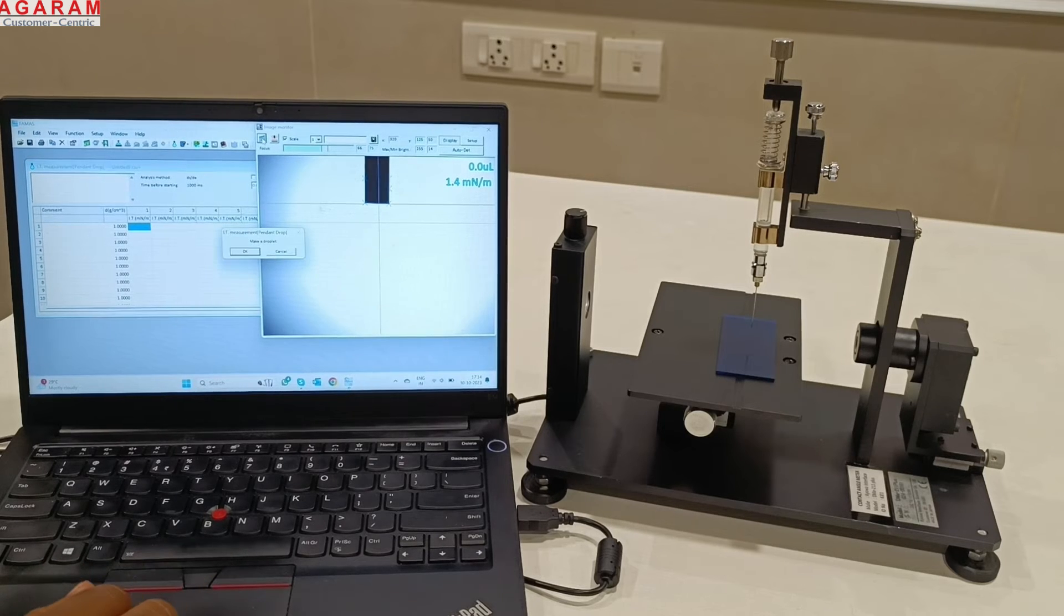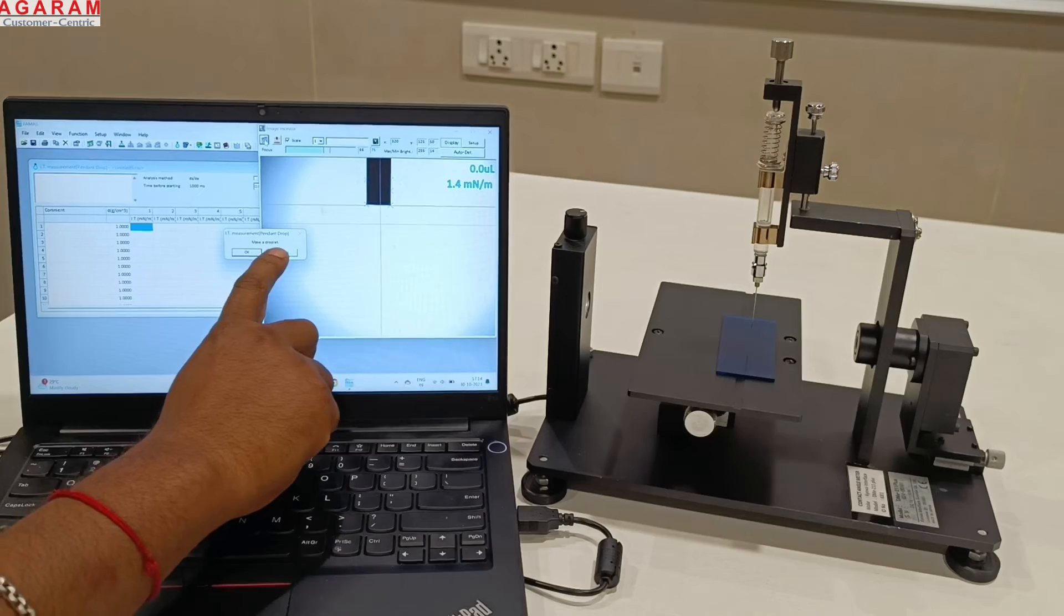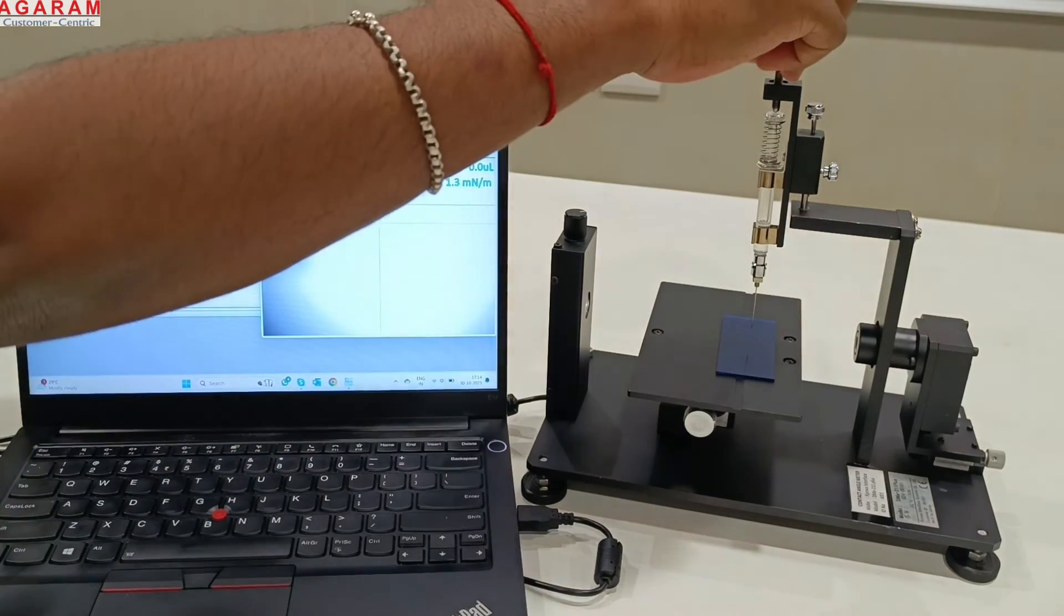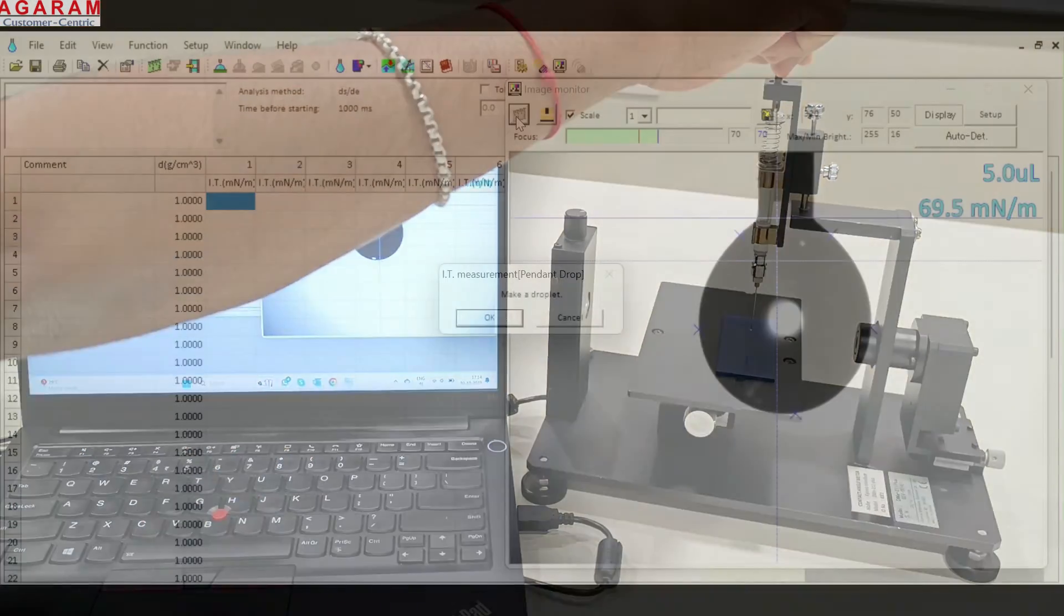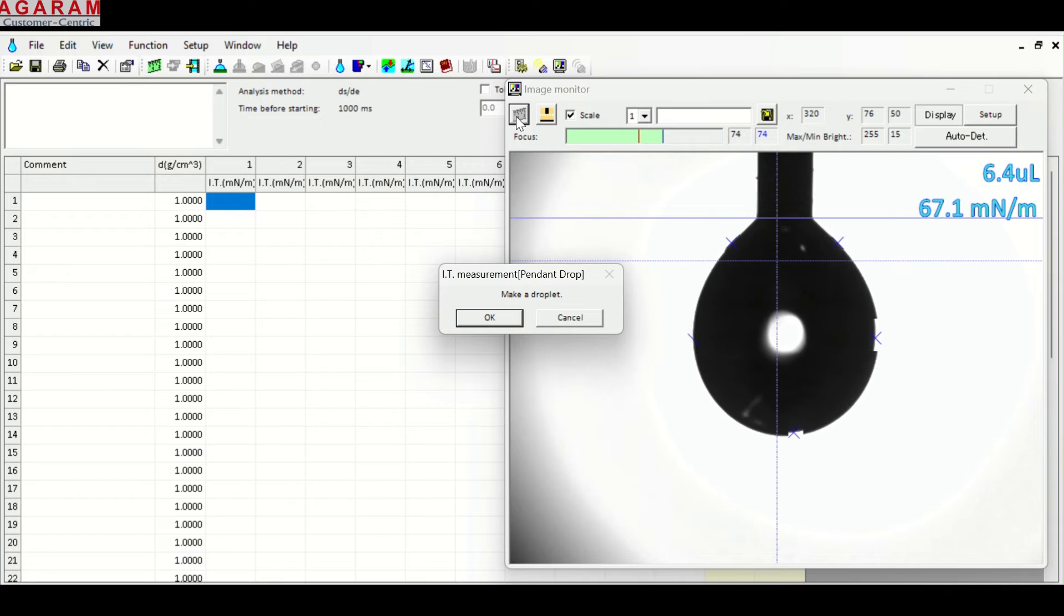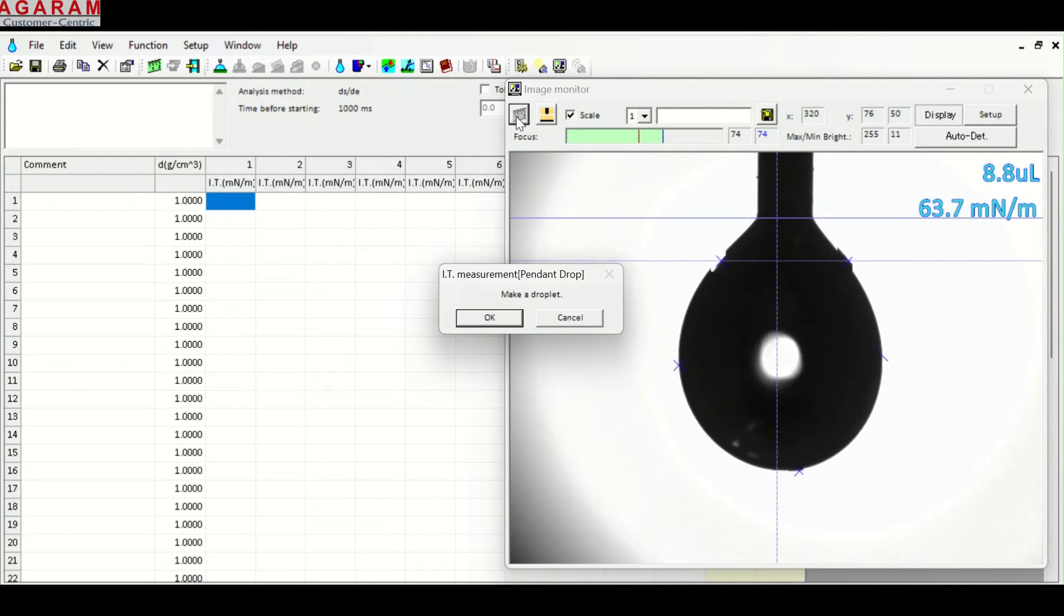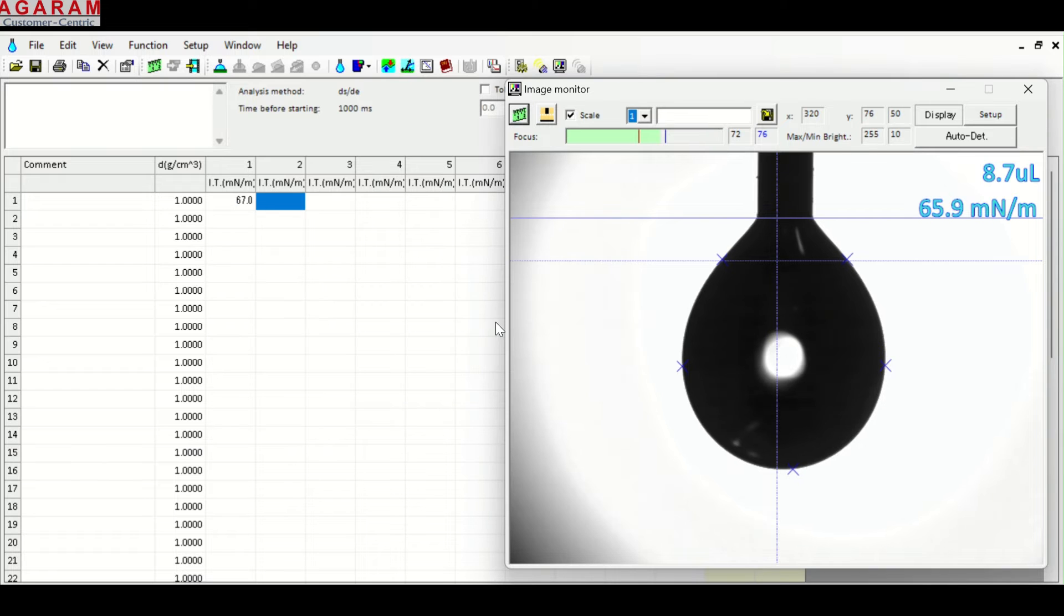DME211 Plus excels in measuring surface tension using pendant drop method. This is particularly effective where sample volume is less than 1 milliliter. By dispensing the liquid via needle, the surface tension is calculated by the software and results are displayed in millinewton per meter.